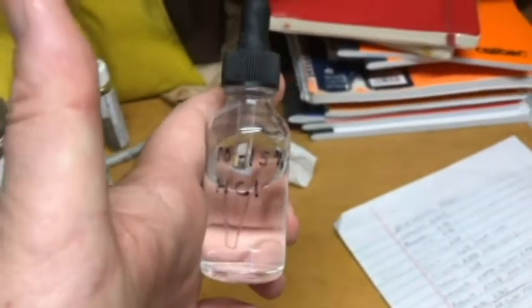So I said there are 3 white minerals. First of all, I just want to say, after doing the acid test, there are no carbonates in this. The weak 3 to 5% acid didn't fizz. The 10 to 15% acid didn't fizz. As a matter of fact, I had to restock the acids this morning, and they'd been sitting on the shelf for about a year. I should have done that anyway. But you put the 10 to 15% on there, and you do get that cloudiness on the rock. It's hard to see. I tried to record it. You couldn't see it through the smartphone camera, but you could see it with your eyes, and the 3 to 5% did nothing, and there's no reaction.